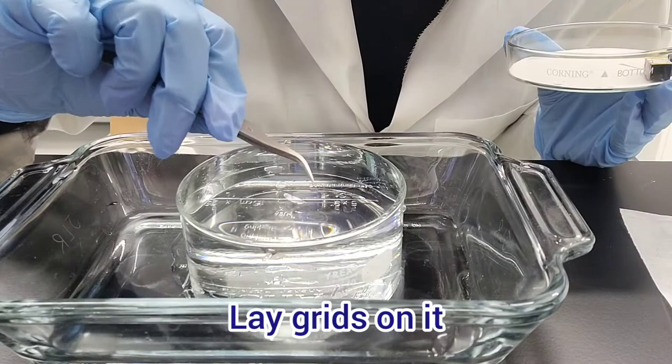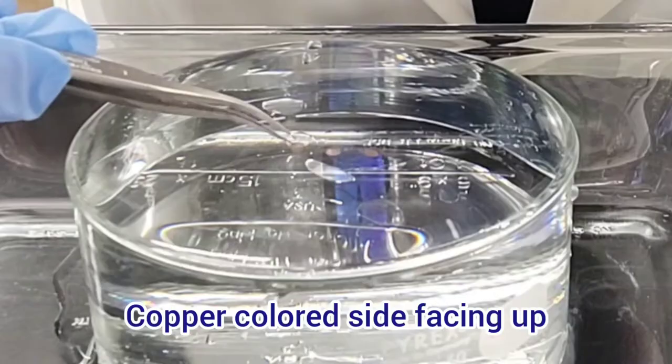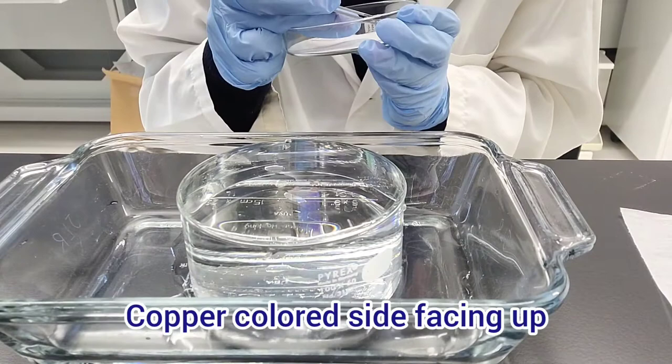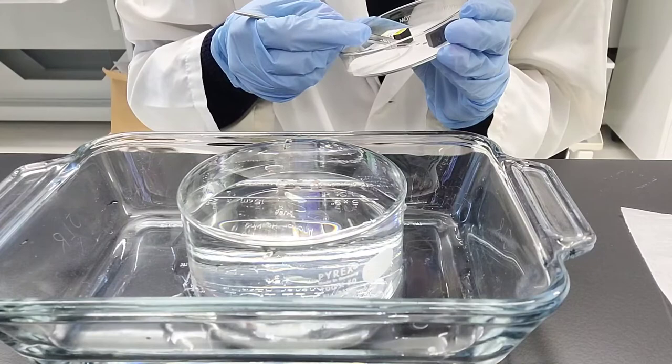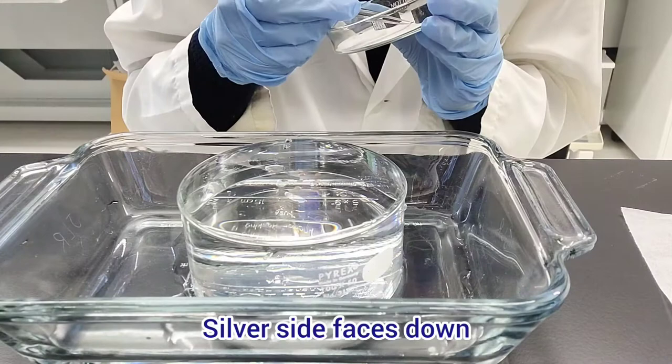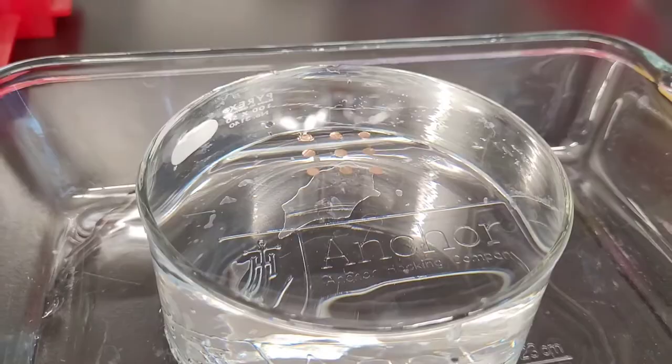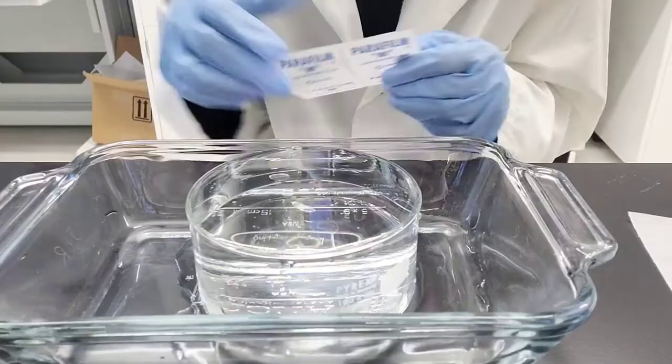Then, with the copper-colored side of the grids facing up, you are going to lay out your grids on the surface. It's good to do it in a regular pattern, like a three by three kind of box. The point here is just to remember that the silver side should be facing down and the copper side should be facing up, because when you put the parafilm on later, you will be able to see the silver side, and that's the side that will get coated with carbon.